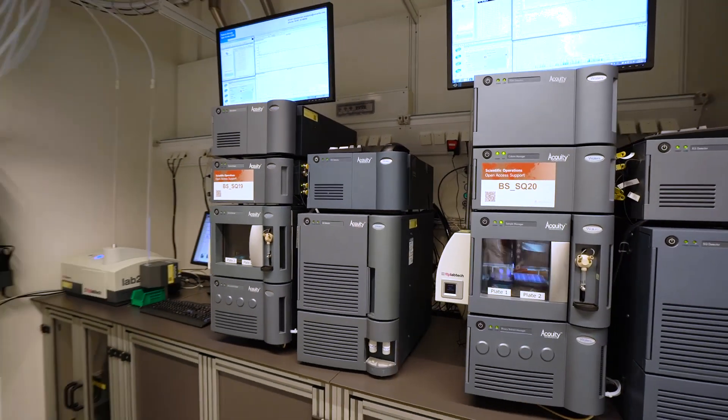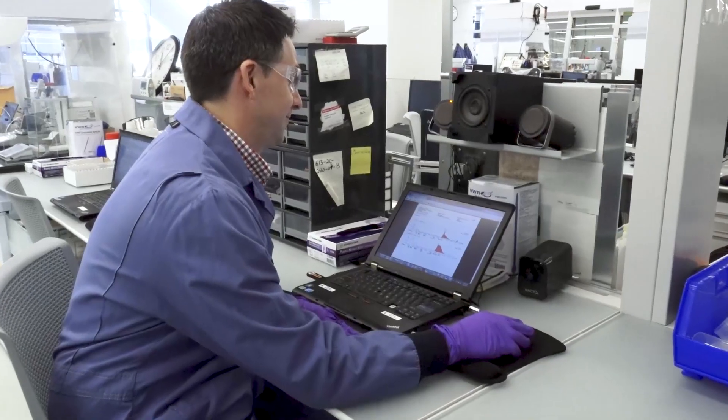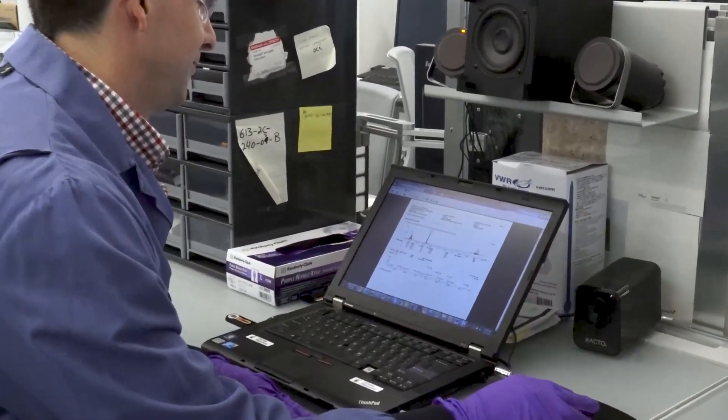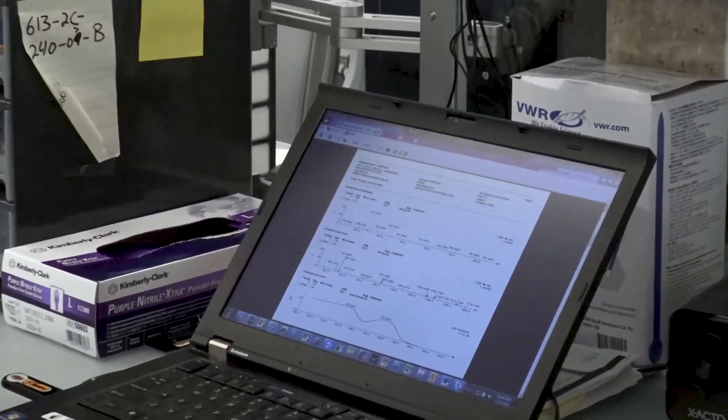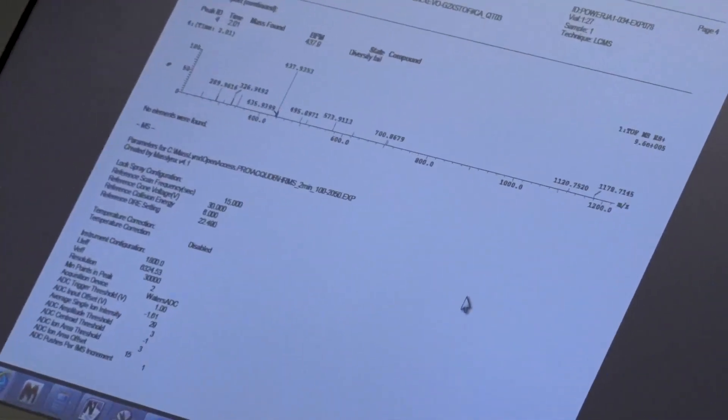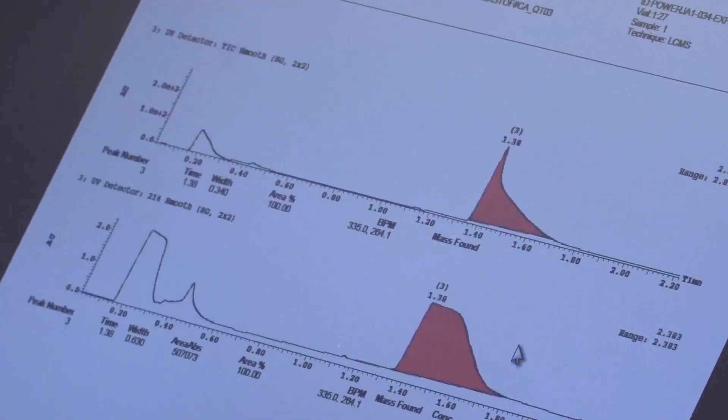Once the sample arrives at the analytical instrument it is automatically processed without human intervention and reliable high quality data is sent to the scientist and anyone else who needs it.